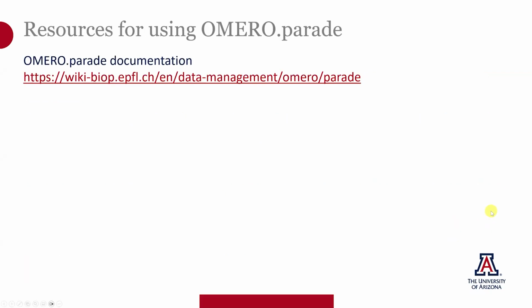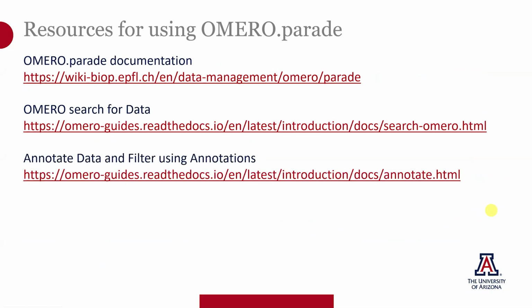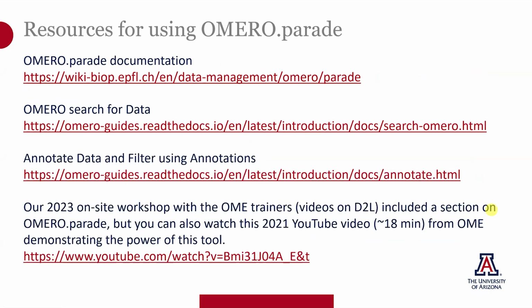Here's some additional documentation about OMERO Parade, along with information about searching for data, annotating data, and filtering it. In addition to the workshop video that we mentioned, email us for access if you're from the University of Arizona. There's also a nice video that's on YouTube directly that you can watch.